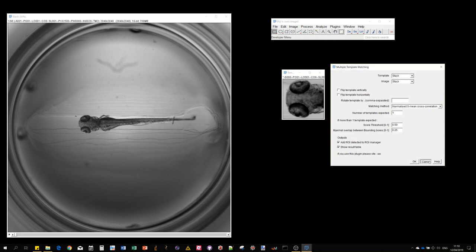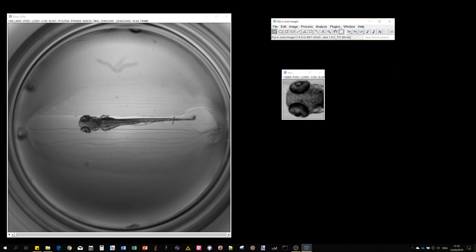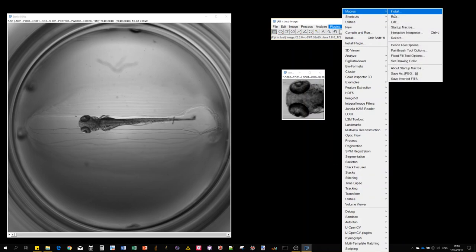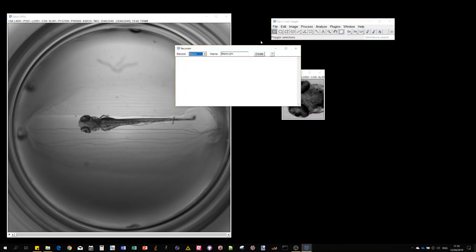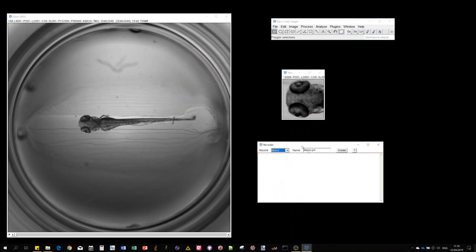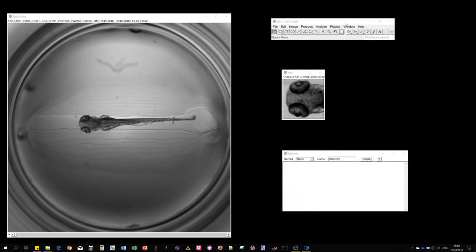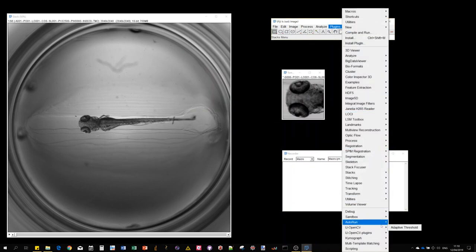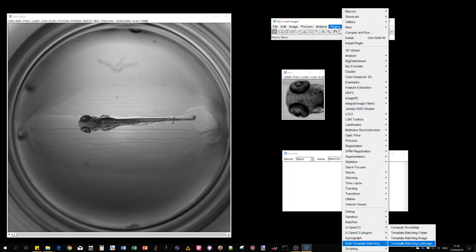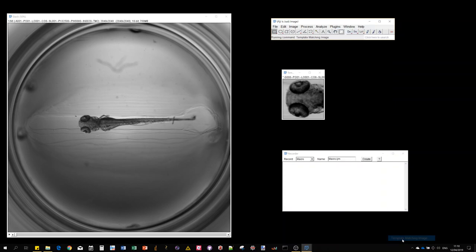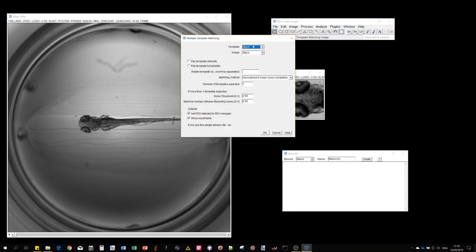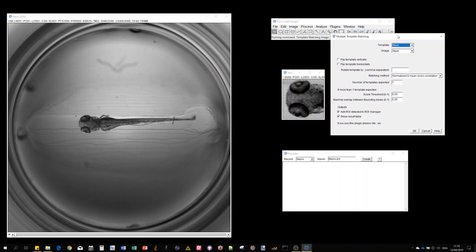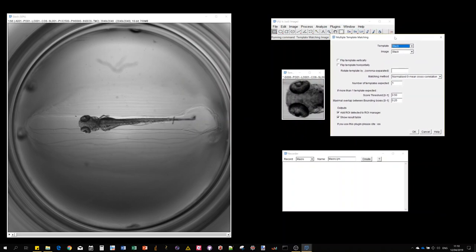Before I start, I'll open the macro recorder because this plugin is compatible with macro recording. After execution you'll see the command that is generated.